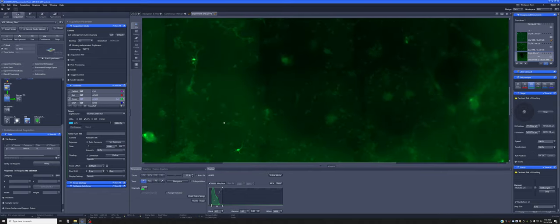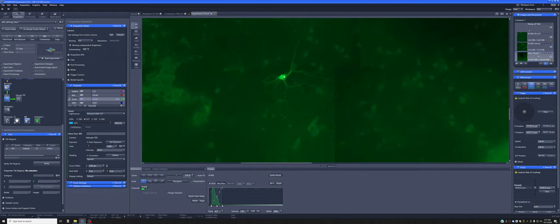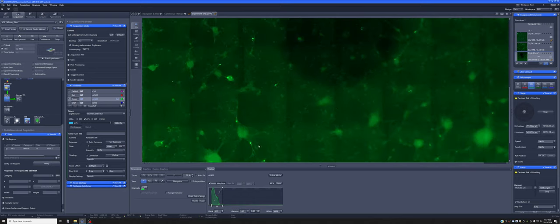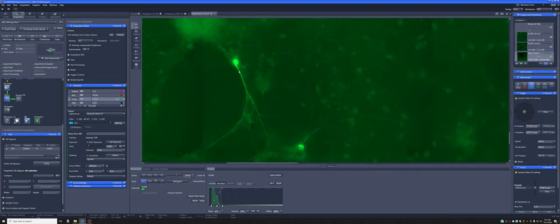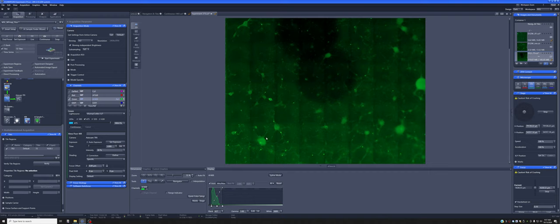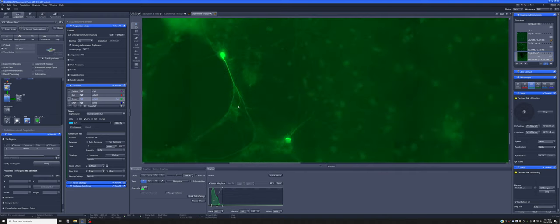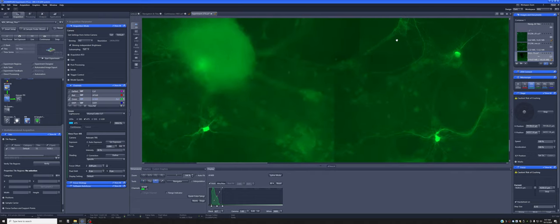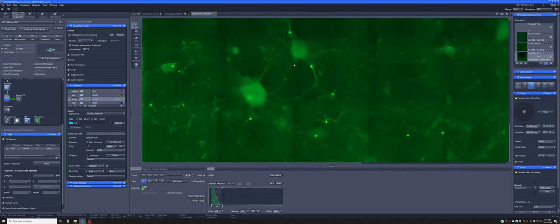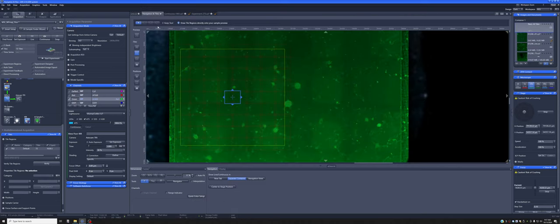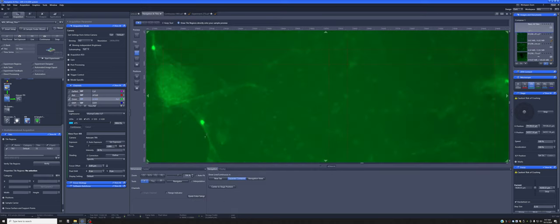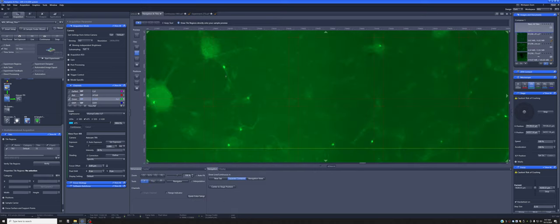And so this might be more helpful if I'm trying to see, do these neurons have branches or things like that, which on the five X image is impossible to determine. So if you look for example, here at this cluster, you can zoom in and see quite clearly, you can see the branching of these neurons here and here. Whereas if I look at the version that I had at five X that's down here, it's just not possible to see that.